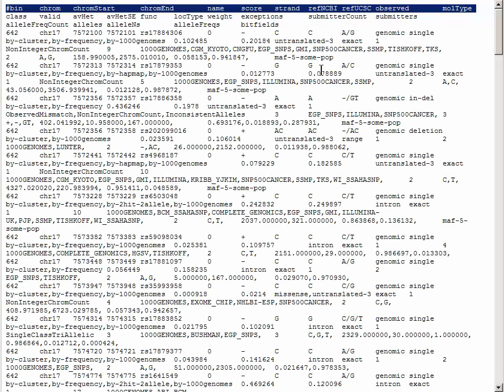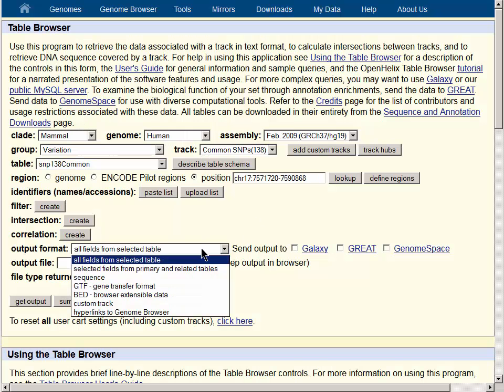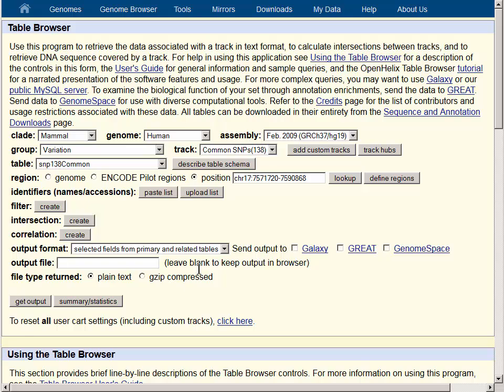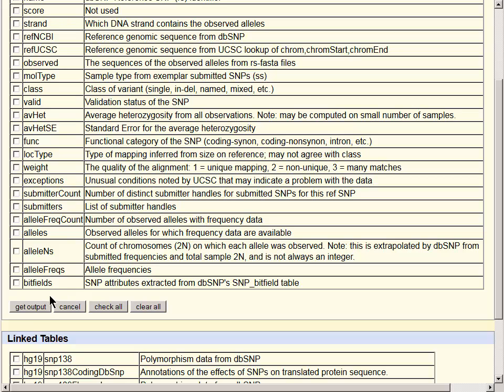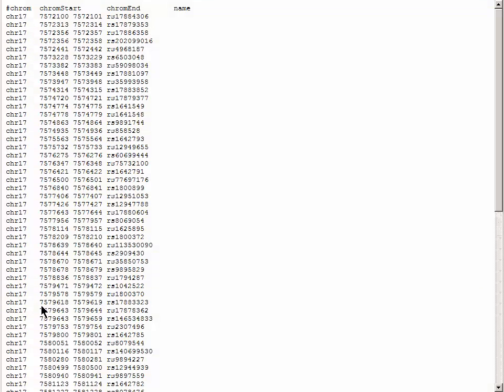If you are interested in a subset of the fields, go back to the table browser and choose selected fields from primary and related tables. From there you will have the option to choose just which data fields you are interested in — chrom, chrom start, chrom end, and name, for example. Beneath the checkboxes you can get output and retrieve just the data you are interested in.